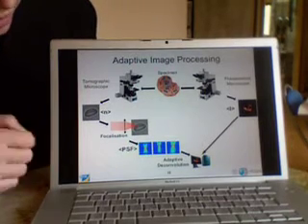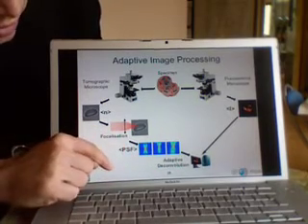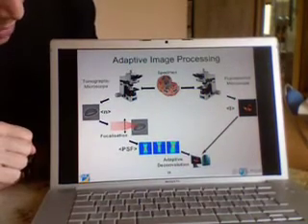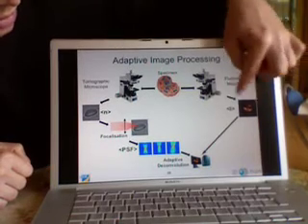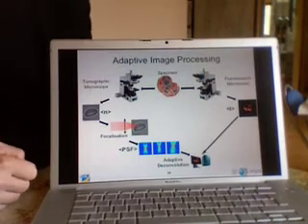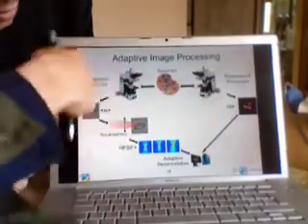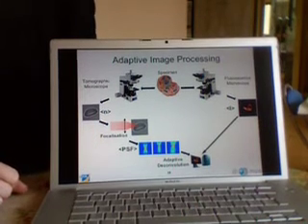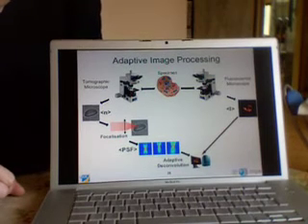What we would like to do now is, from this index of refraction, compute a so-called point spread function distribution, and then reconnect both sides of this diagram by using the index of refraction distribution to better correct the fluorescence intensity distribution. Okay, so this is the fluorescence microscopical approach, and this is the tomographic microscopical approach, and you combine both of them. Yes, that's what we would like to do in the near future, to recombine both techniques in order to get better images.